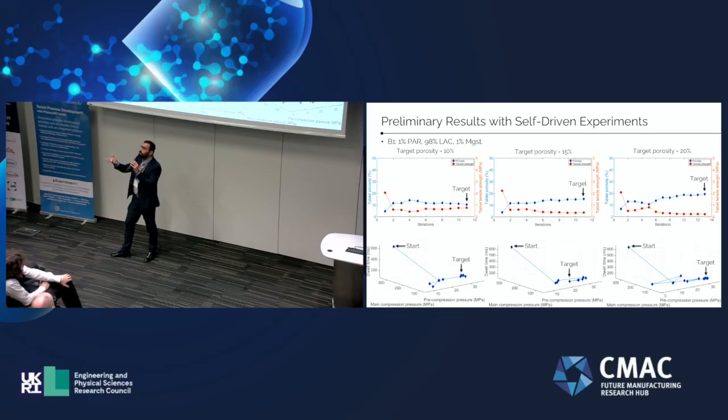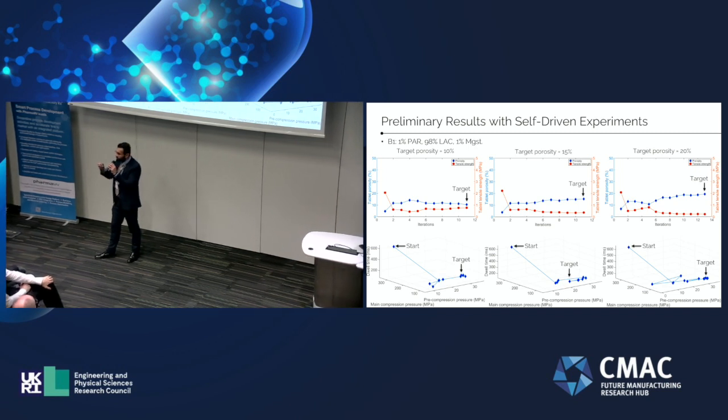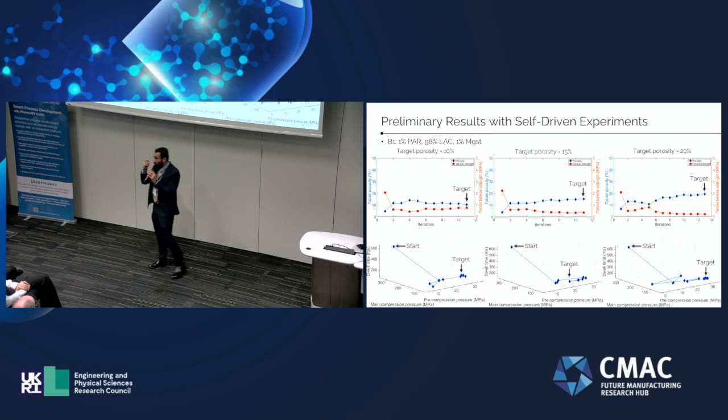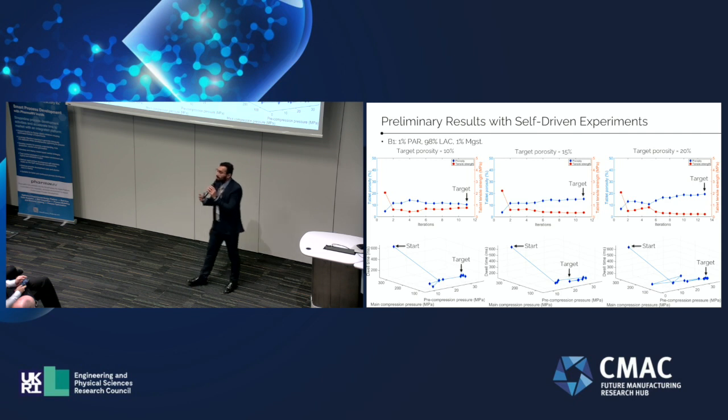So, for example, if the blend was comprised of paracetamol, DCP, lactose, what he's trying to do is calibrate his models based on the individual scans taken from lactose, DCPA, mannitol, and based on that, he's trying to predict it. And I think if you visit him at his poster, he might have presented some of his results, that this predictive technique was quite accurate, like above 98% or something like that. So yeah, I'm not too sure if that has answered your question related to calibration.